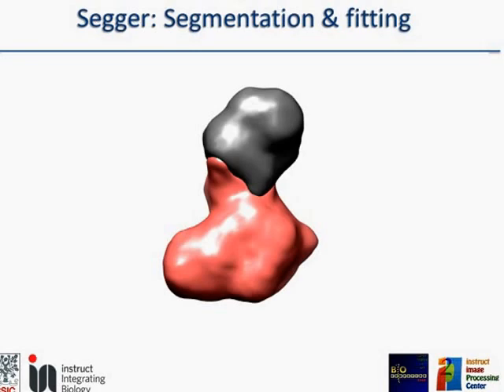So for example, if I now choose this segment here and I ungroup it, I will obtain something like this. Okay, this makes more sense. I have to fit here three subunits and four subunits, and at least now I have three regions.